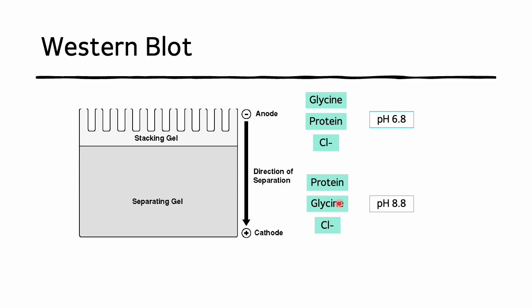They get free from these two molecules, so they can move according to their own speed. And due to the fact that this gel is polyacrylamide gel and it works as a molecular sieve, they move with different speeds according to their molecular weight. We can successfully separate those protein mixtures according to the size.